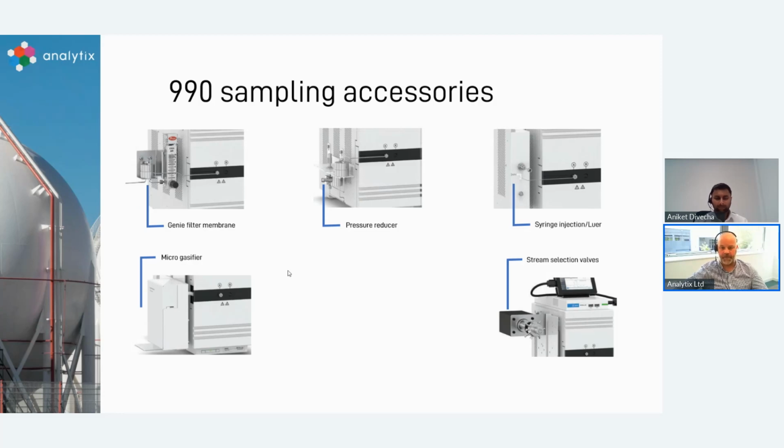And then once it's all connected up, you can create sequences. So you can sample from different reactors at different times, and then you can interrupt these sequences as and when you want. And that is not just for process systems, that is for the lab instrument as well. You can't fit the stream selector to mobile systems. That is just a single sample inlet platform.